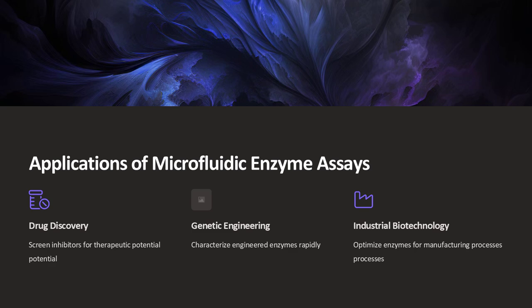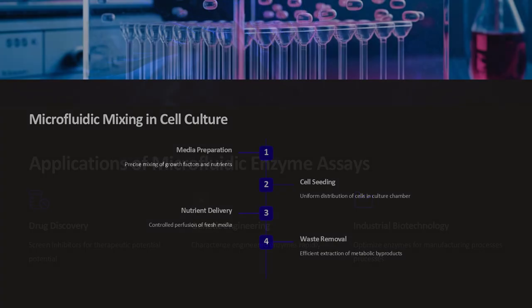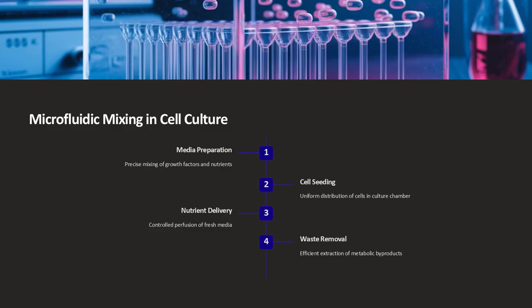Multiplexed microfluidic platforms also illustrate the power of precise mixing techniques. In these systems, multiple reagent streams are combined in a controlled manner to perform complex assays that require the simultaneous detection of multiple targets. For instance, a diagnostic device might mix a patient's blood sample with an array of different antibodies in separate microdroplets, each targeting a specific biomarker.